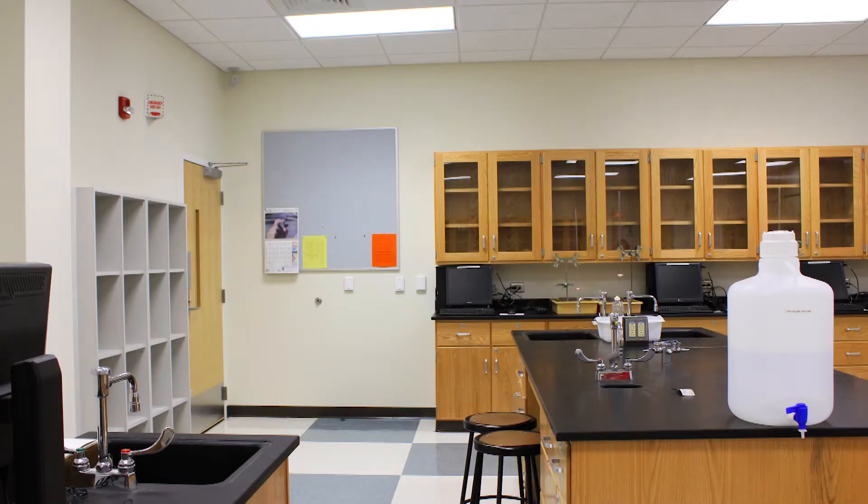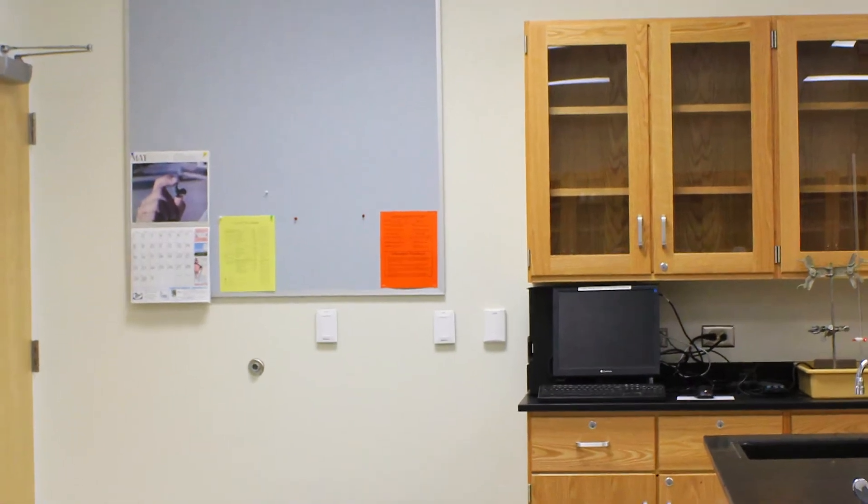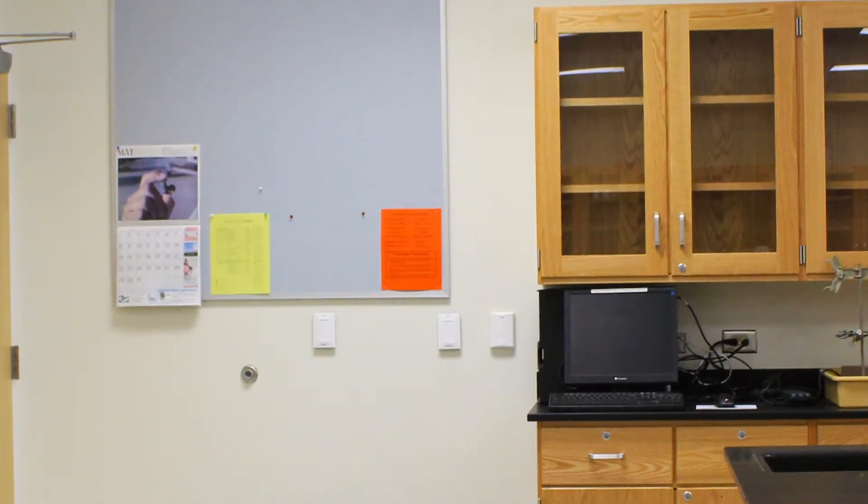At some time during lab, an accident may occur that requires emergency personnel. Various emergency phone numbers are posted in lab, however you may need to use your cell phone to make the call. Phones are not located in lab. Your instructor may ask that you contact the main office for assistance.